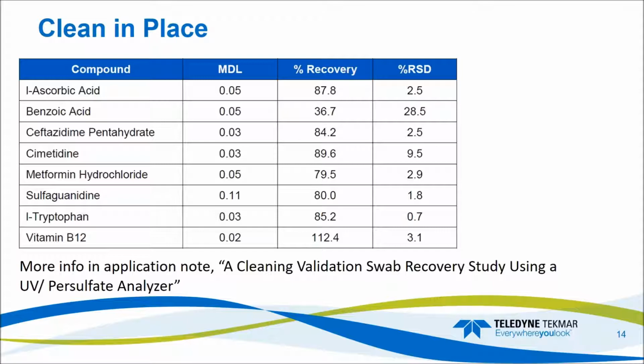So TOC is a great method. It's kind of a catch-all method to determine the cleanliness of equipment, since it picks up anything from residual drugs from previous batches, cleaning solutions, bacteria, and foreign objects. Usually all these contain carbon. So if you swab it, you can check for all those things which you do not want in your pharmaceuticals. So these are the results from our application note.